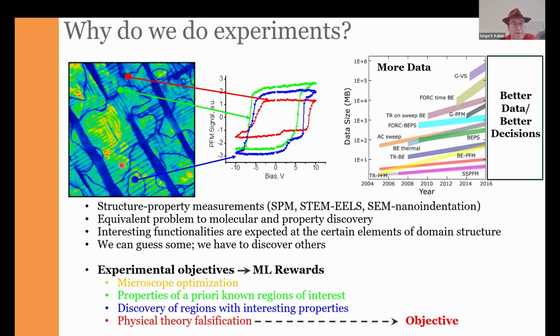If we take measurements at several locations with the stripy domains, and the results are the same, we are probably not going to explore other locations because we already know how these regions behave. After that, we can look at this region because there are clearly some anomalies here. And after that, we can say that, look, this is the ferroelectric wall. This is the region with the high curvature. So maybe we should take measurements here because we expect that there would be signatures of the flexoelectric coupling.